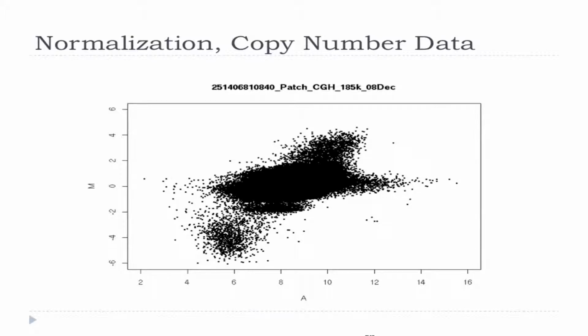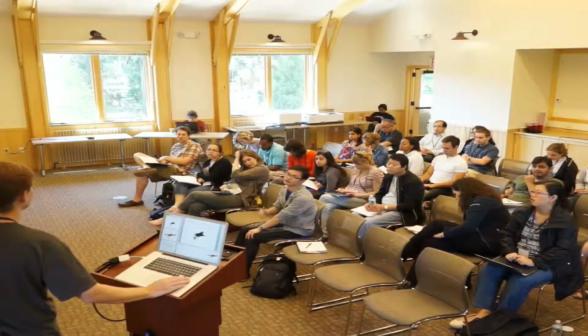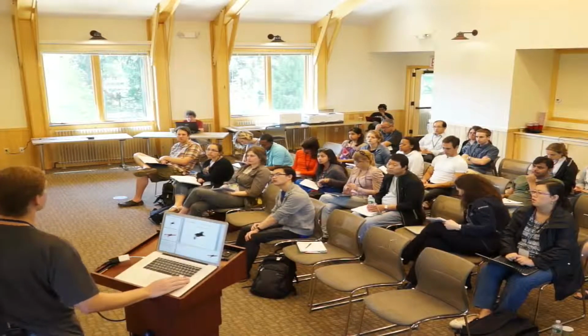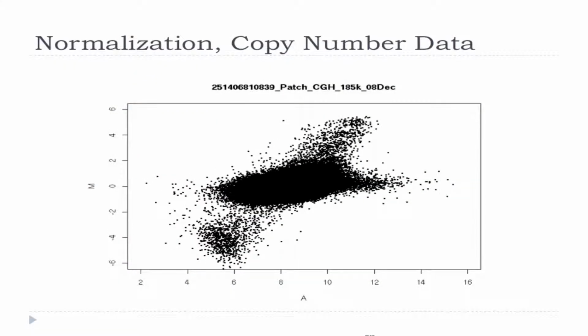For array stages, do you align them to the genome so that you can compare to the labeled regions? Yes. So the question is, do you do this by essentially lining the probes up along the genome and looking at other probes? Yes, we do that.